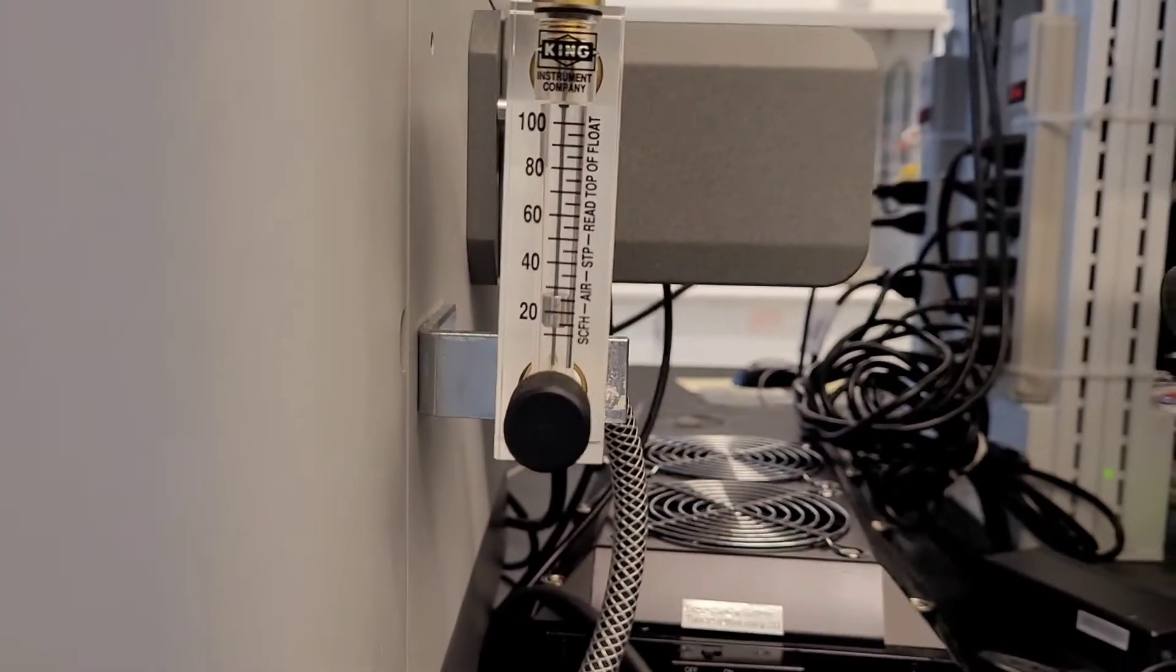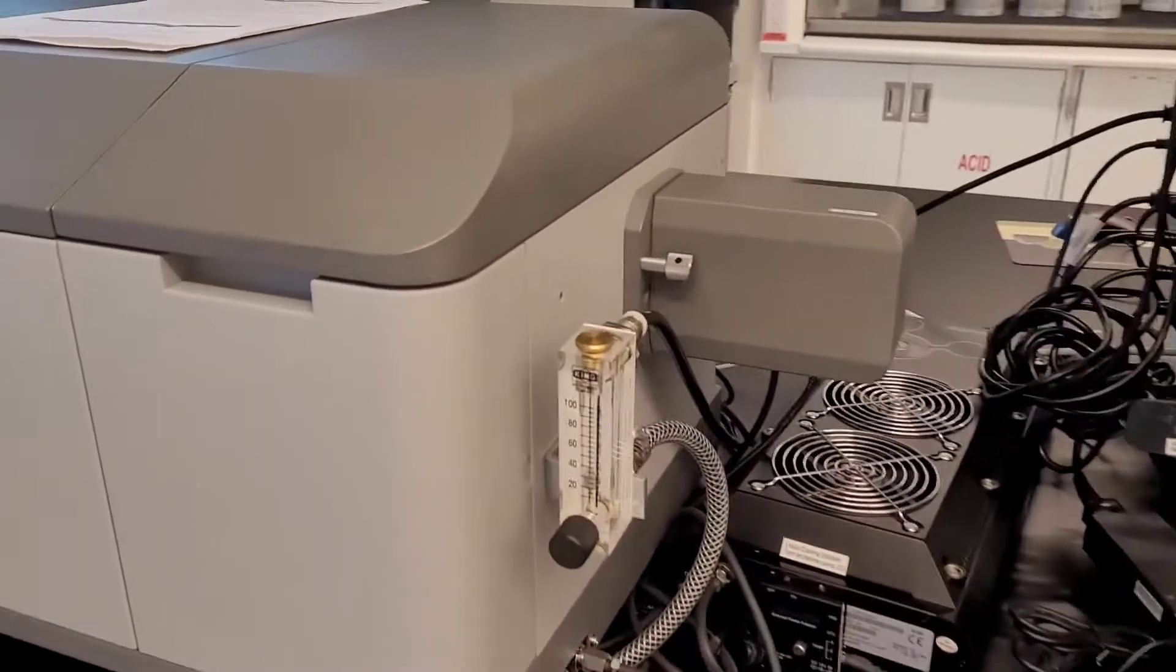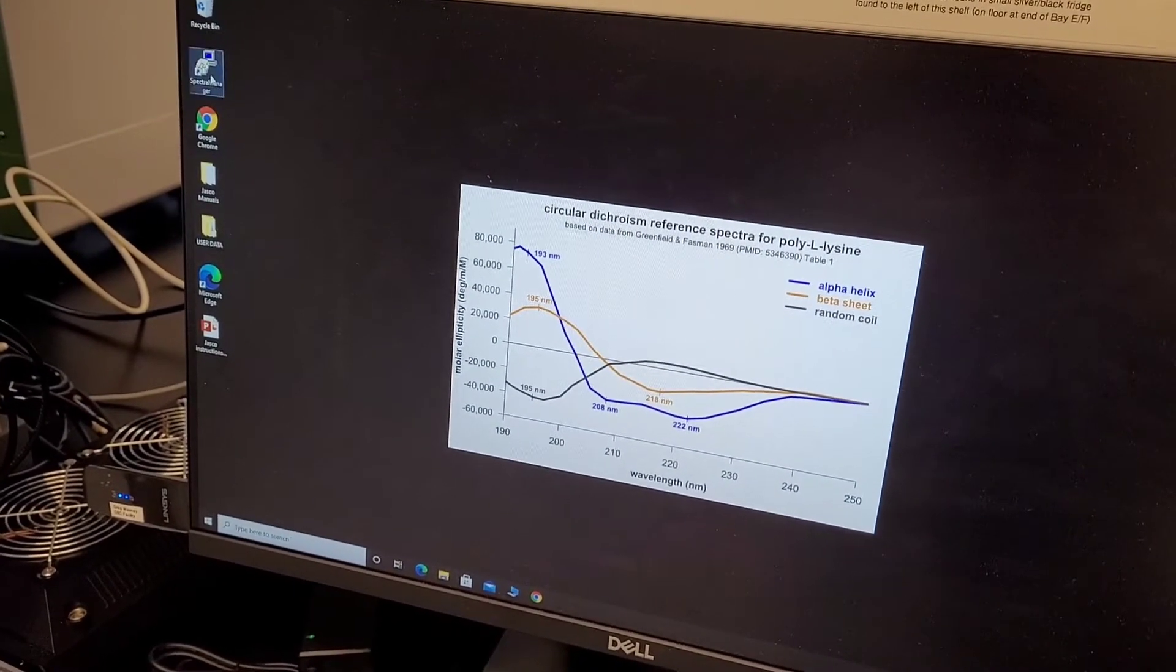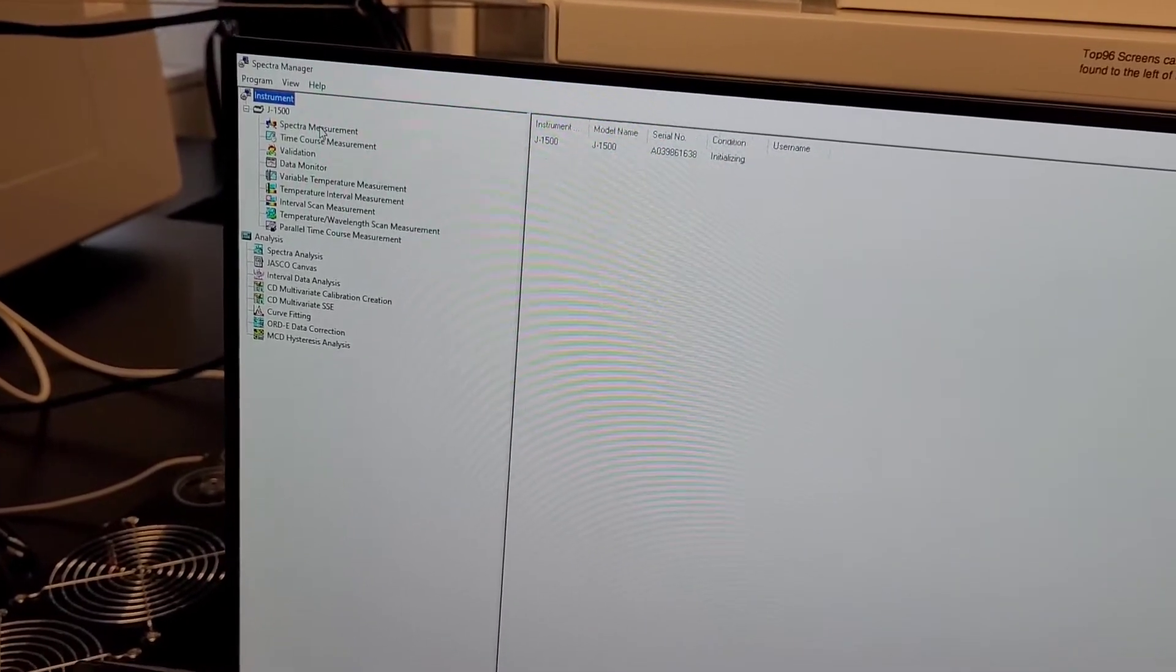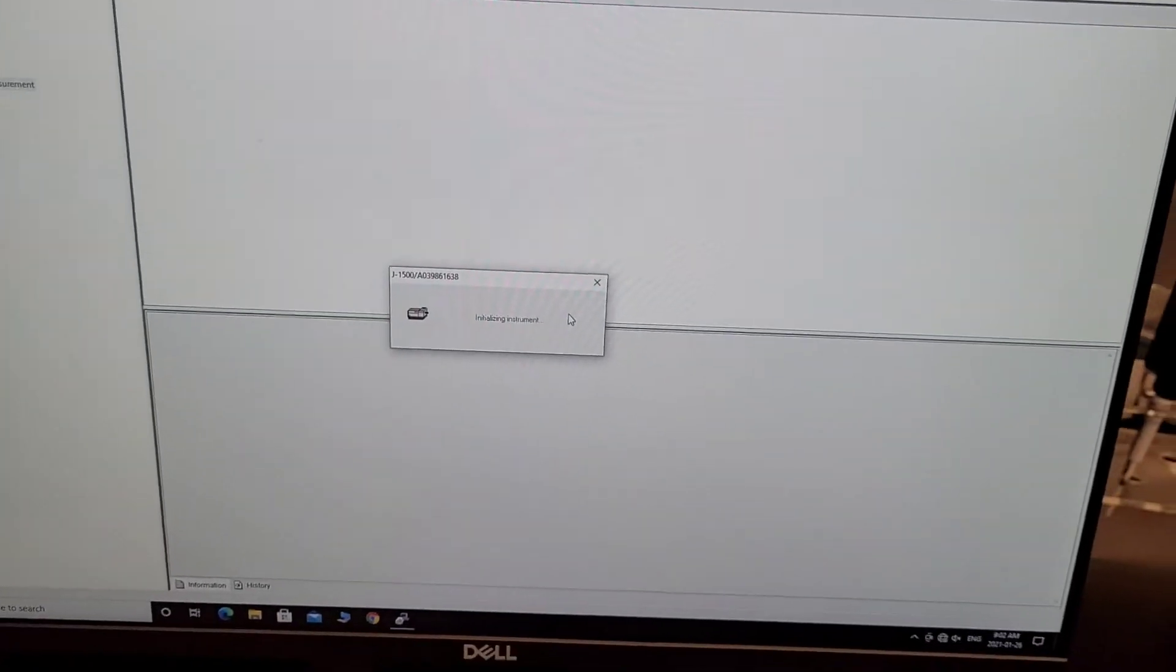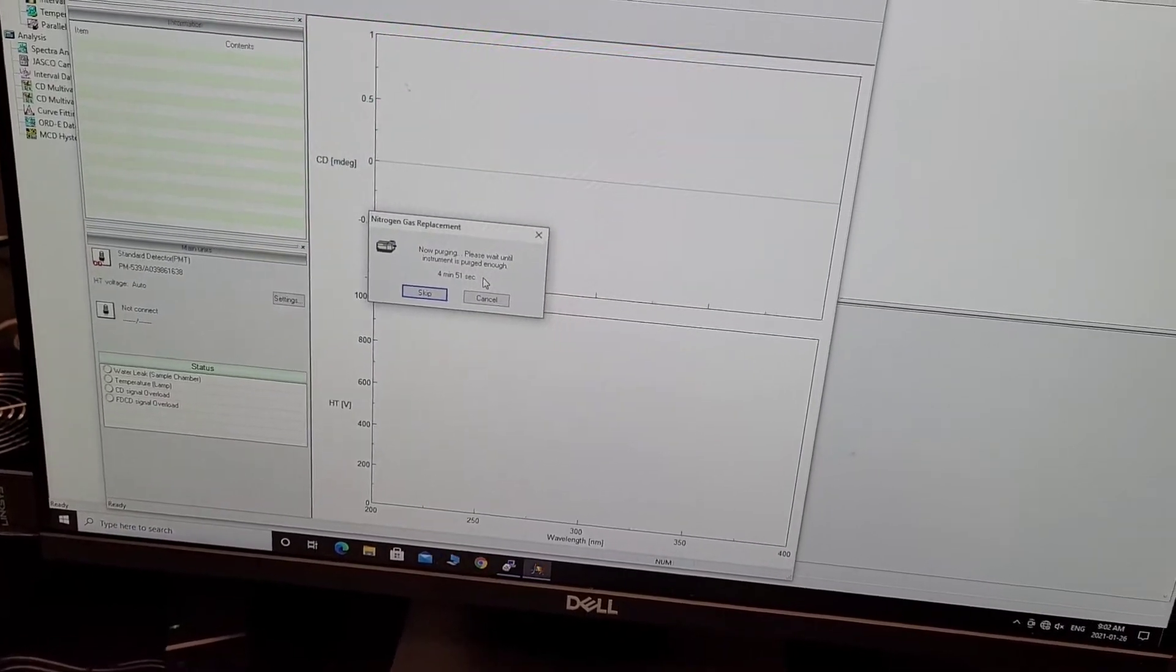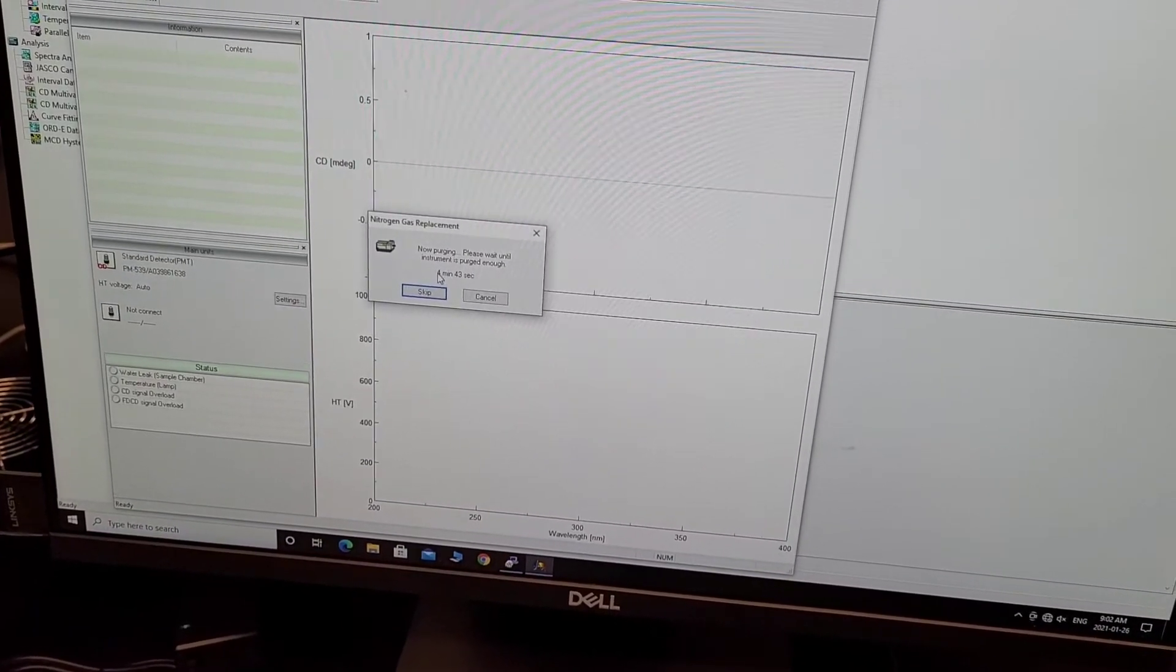After a few minutes, you can turn on the instrument. Then you can load the software depending on your particular type of CD. For just the typical measurement, we select spectra measurement. It will initialize the instrument. Just to make sure that the instrument is filled with nitrogen gas, it has this built-in time. If you already purged, you can skip it, but I usually just wait this time.